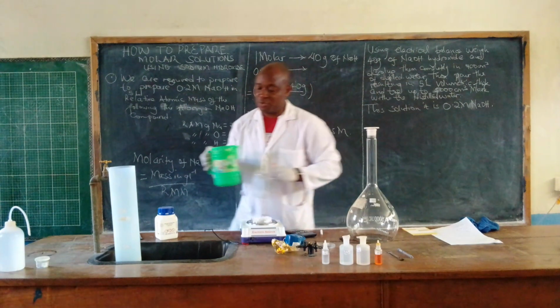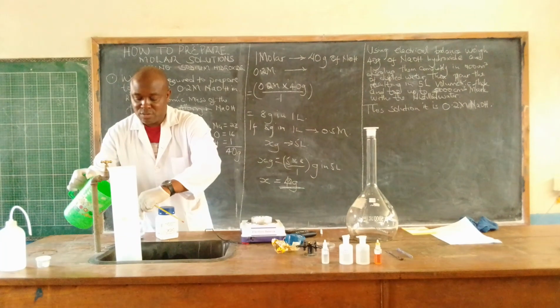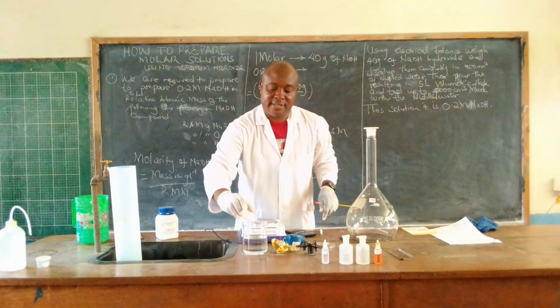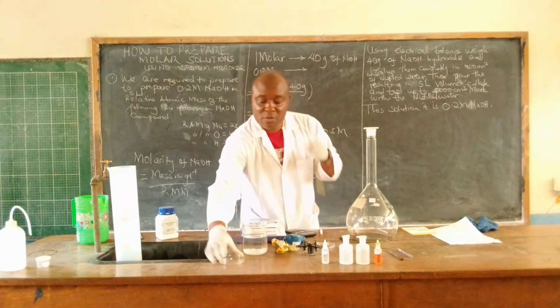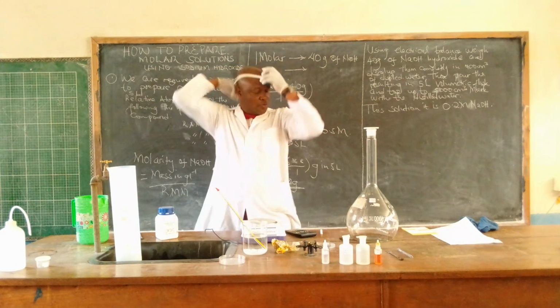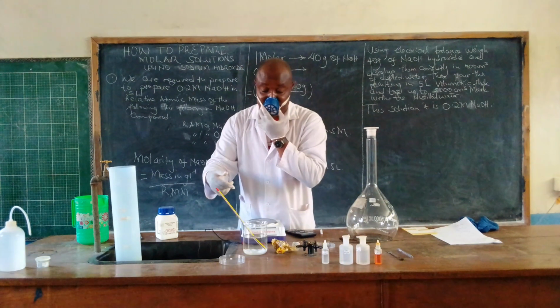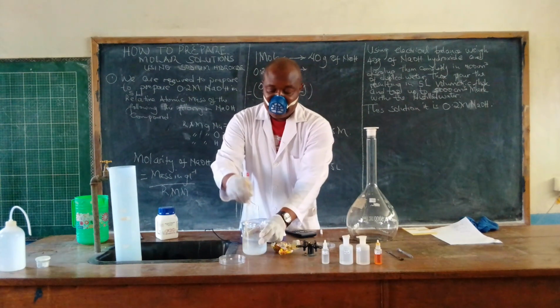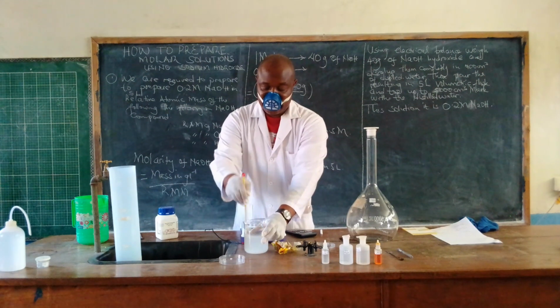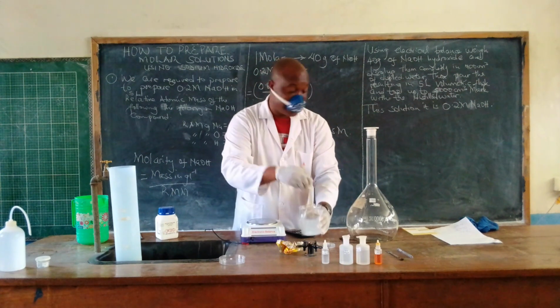Therefore, we are now trying to react to make the solution. So you put all the pellets inside here. After you have done that, you are supposed to put on your mask because it also produces some fumes that are very irritating. So you stir, you stir like that. You stir until everything dissolves.